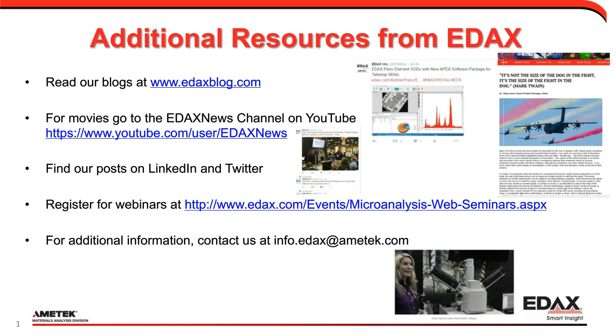If you're in a regulated industry, you might want to calibrate every 2 to 4 weeks, but many users go for 1 to 3 months or even longer. In fact, it's not unheard of to not calibrate at all with a silicon drift detector and just save that for your service engineer.